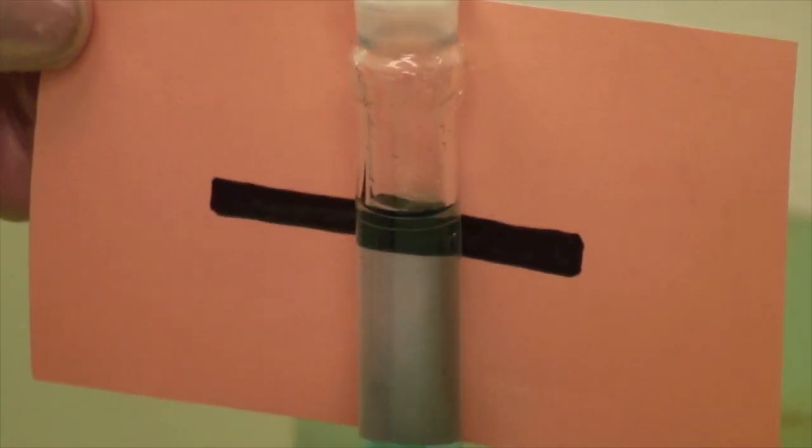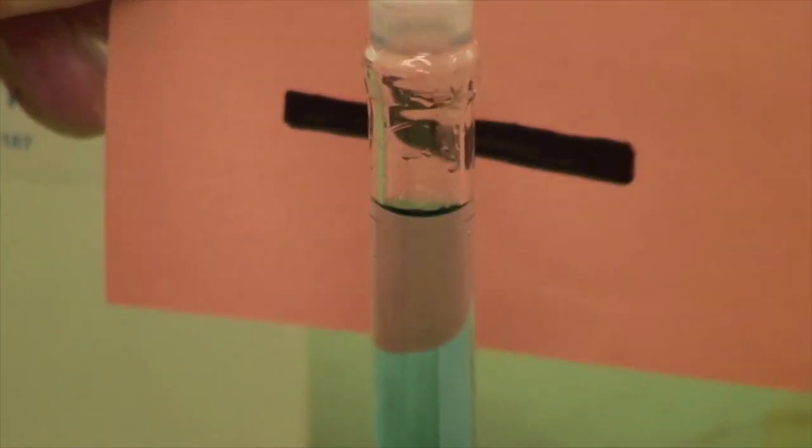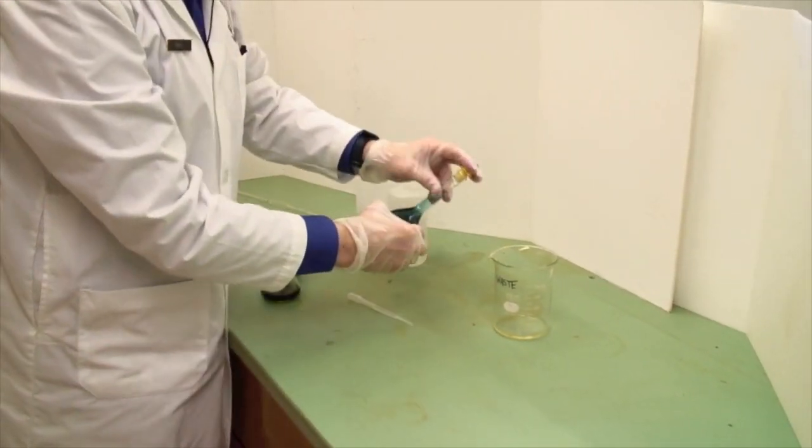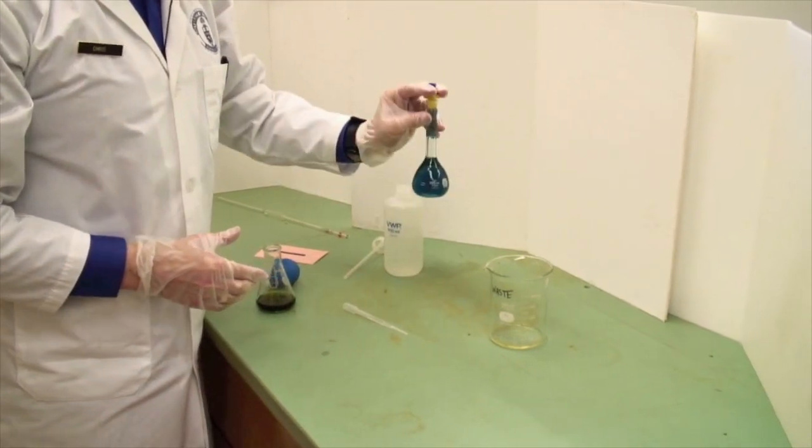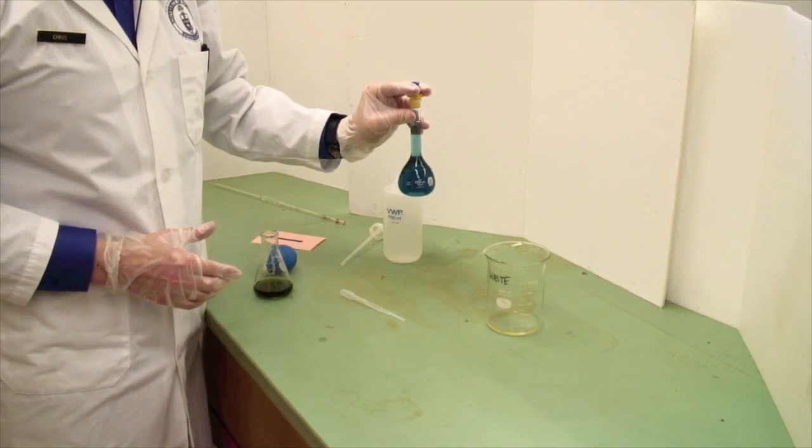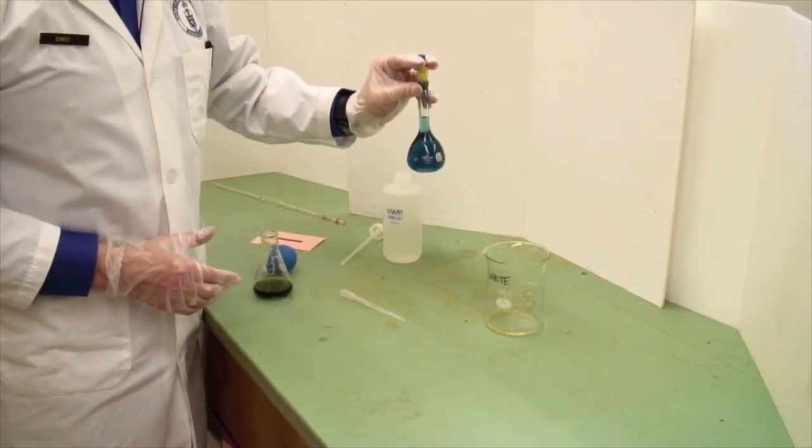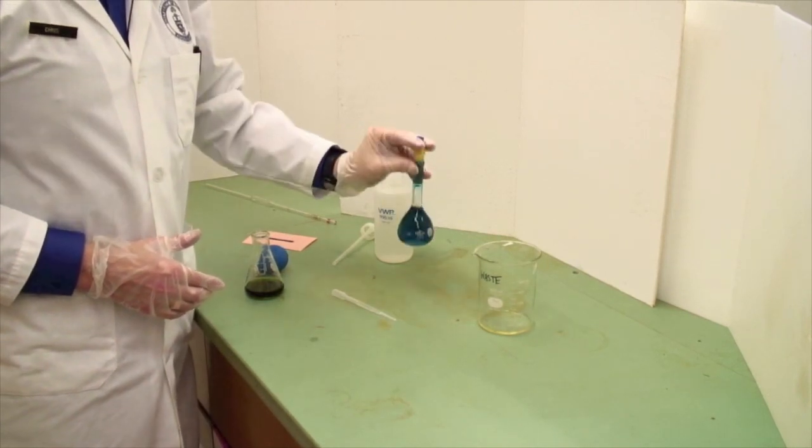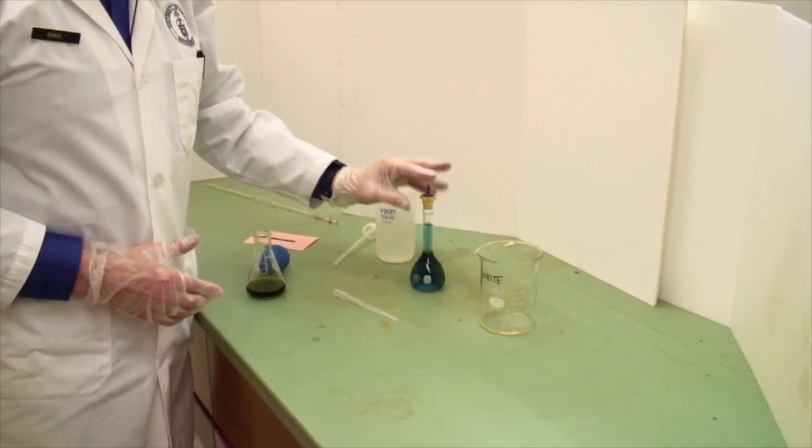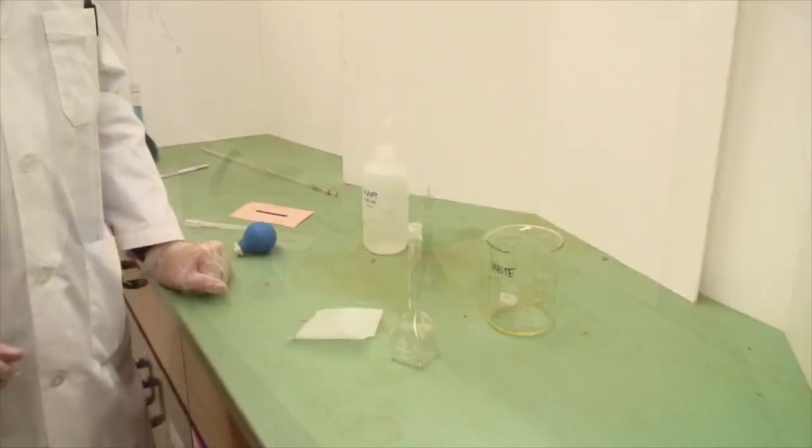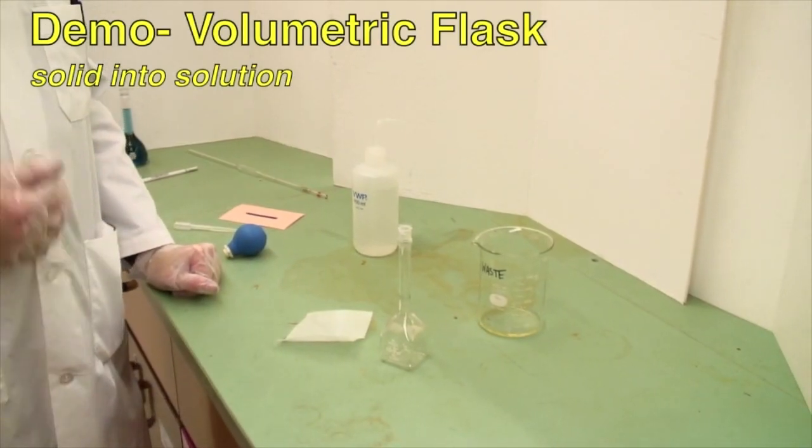The meniscus is tangential to the calibration line. Now that I've got it actually at the line, again, put the cap on, hold it with my hand, and invert several times to make sure that I've got a uniform solution. And this is now a 100.00 ml solution of 10 mls of my initial liquid. The second way of using a volumetric flask is to dissolve a known amount of solid.